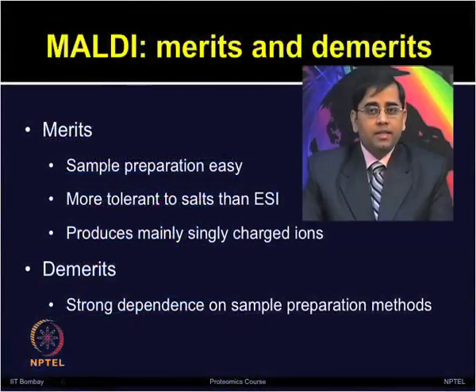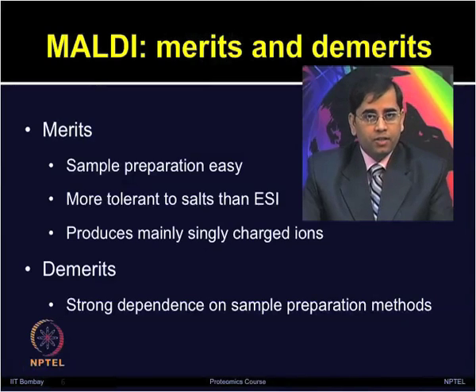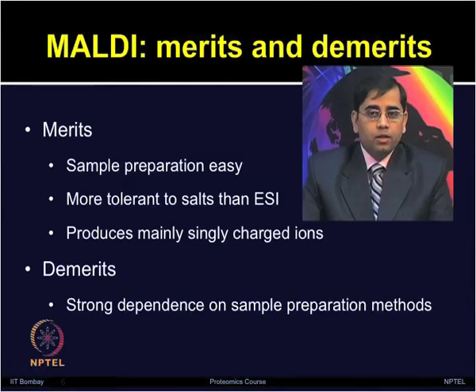Here are the various advantages and disadvantages of using MALDI as an ionization source. The sample preparation is very easy. MALDI provides high tolerance to salt as compared to the electrospray ionization methods. MALDI produces singly charged species. Most analytes can accept a single proton.